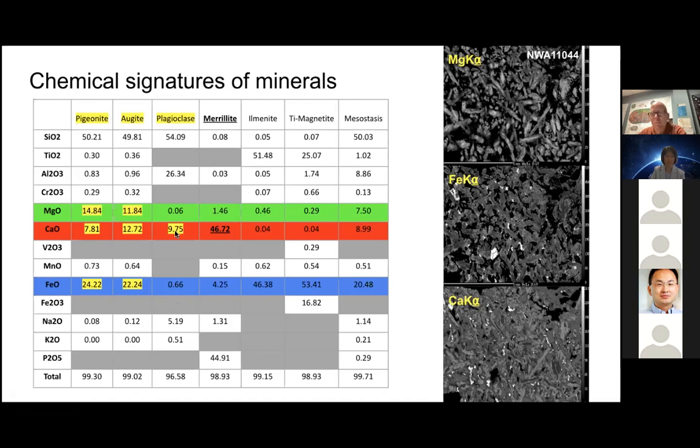It does have some calcium. So again, we can use that calcium map and the brightness values of the pixels in areas like this to determine that those are areas composed of plagioclase feldspar. We can cross-reference it between the other maps to see that a lot of those same areas appear as dark areas where we're not measuring any concentrations of magnesium or iron.